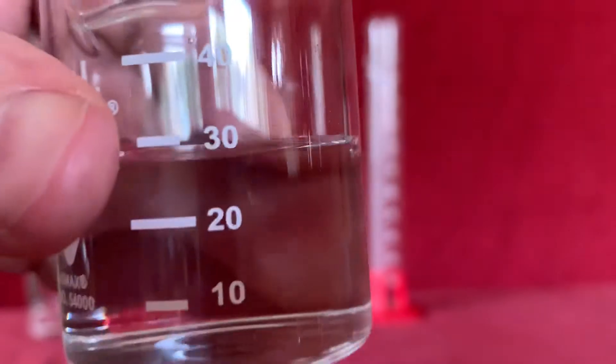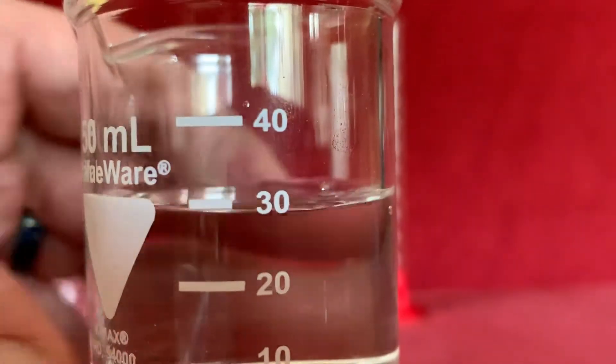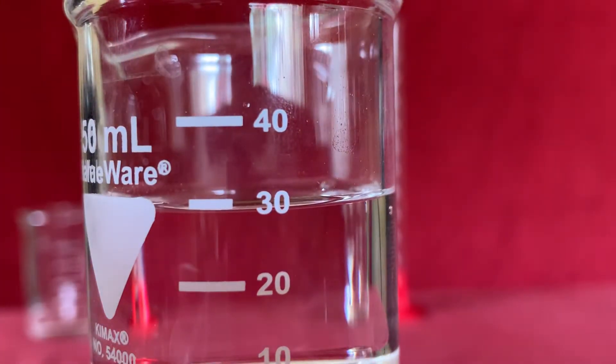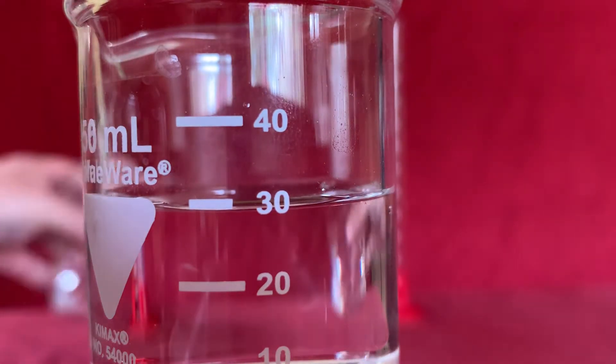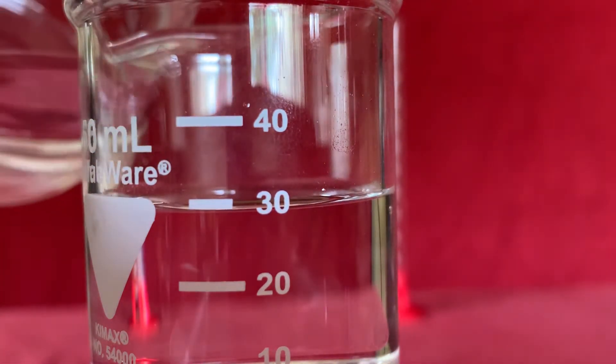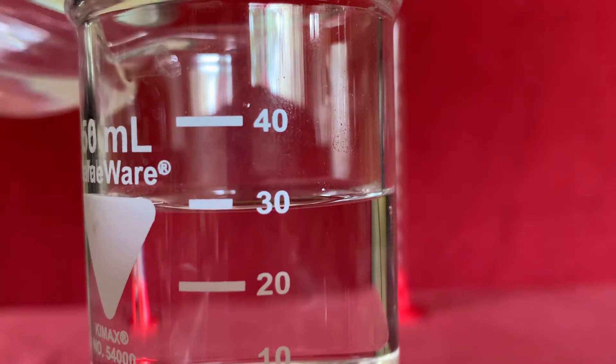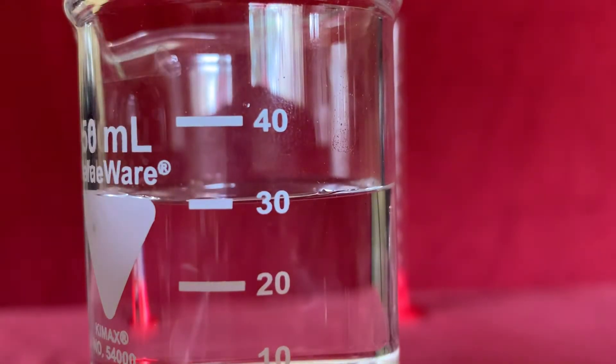Let's take a look at how we've done. It's a little low. Let's add just a little more. There we are. We can see the bottom of the meniscus right on that 30 milliliter mark.